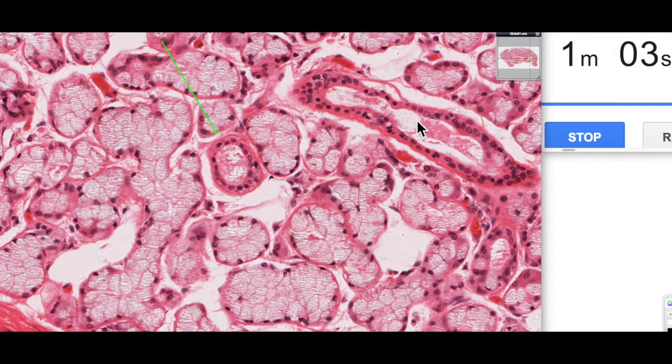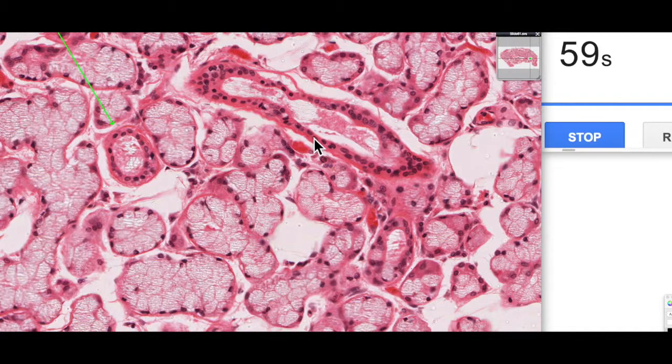You can imagine it connecting to this region here. You can see them, and it looks a little bit multi-layered just because of the angle of section. But over here is a nice example of it being simple, and then these nice round nuclei side by side.